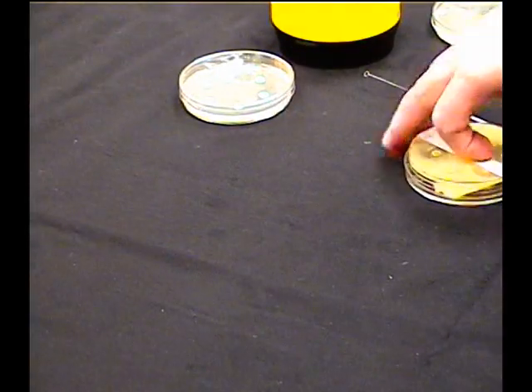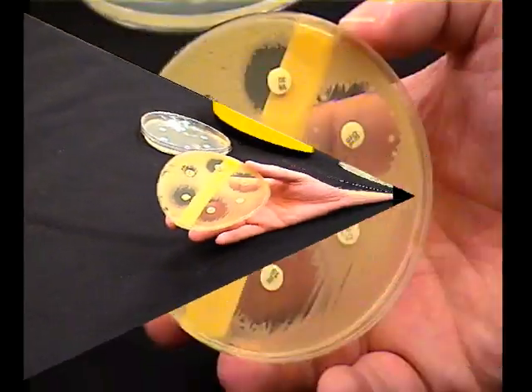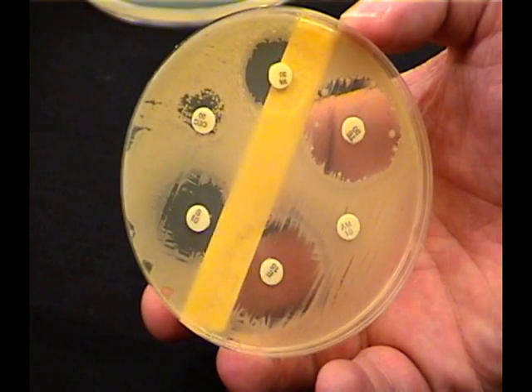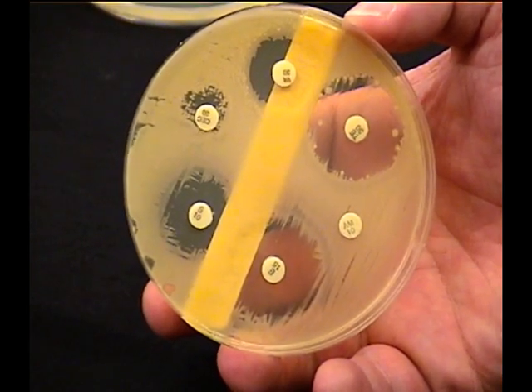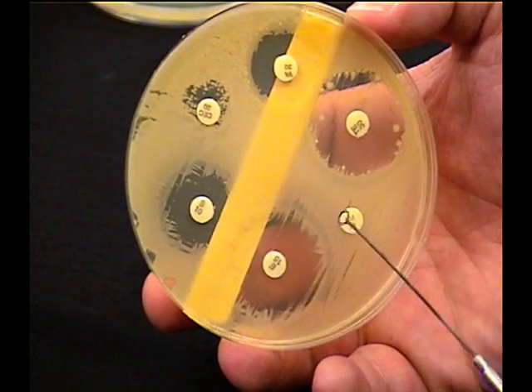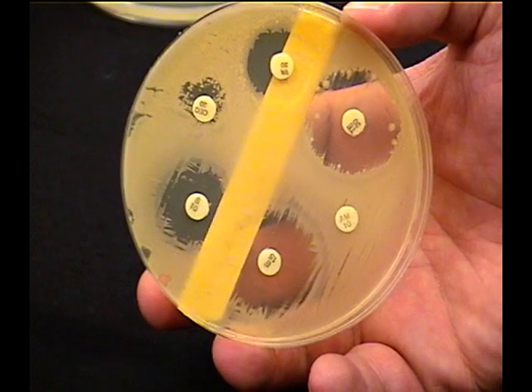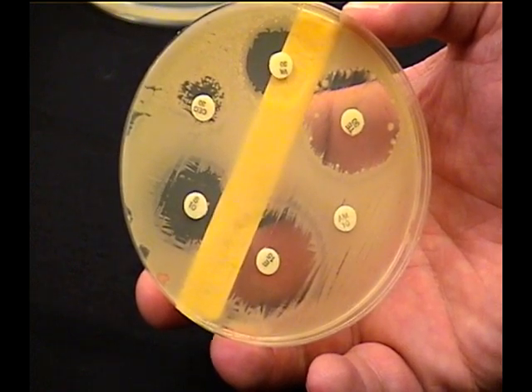Now, here's what one winds up looking like. This one's been incubated. What you'll notice is, in this case, this one that says AM10, or ampicillin 10 micrograms, it doesn't affect it at all. The organism is resistant.